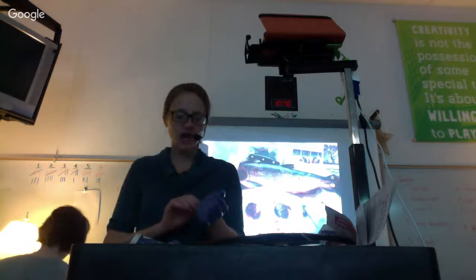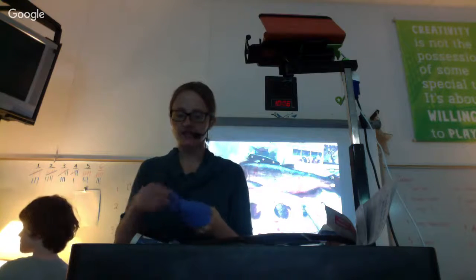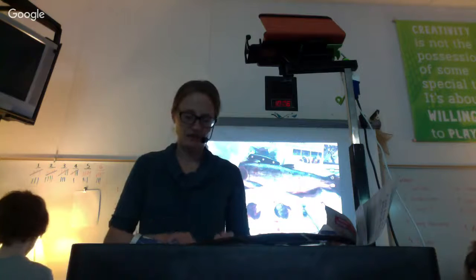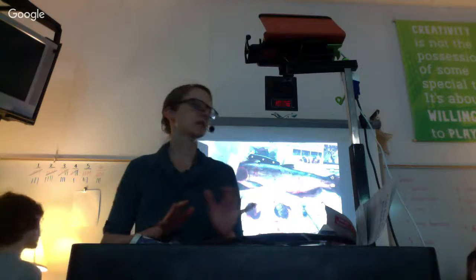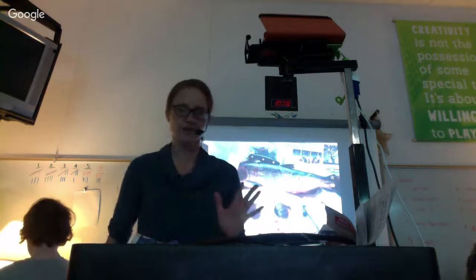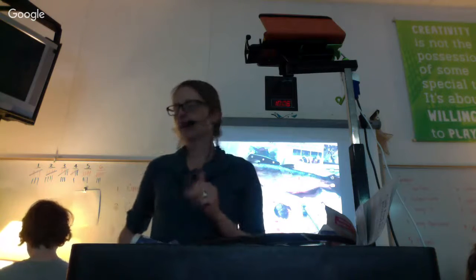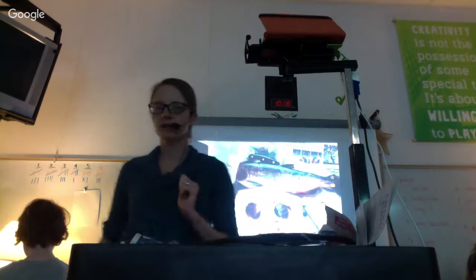So what you're going to do, and we do have quite a few gloves, but if you'd like to reuse these, it depends how dirty you are, you can take these and just place them gently on. I'm going to reuse these because they're not that damaged. Place them on your newspaper, okay?